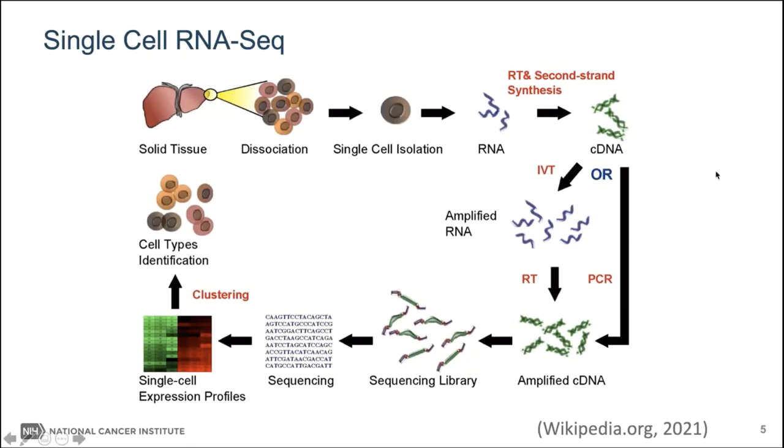The RNA-seq happens along with the barcodes so that you can tell them apart. Each expression profile is performed on each single cell, and transcription profiles can be identified based on one cell rather than traditional RNA-seq, which happens across many cells all at once, all in the same mix.